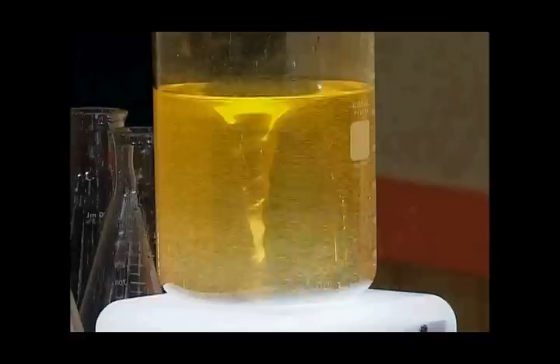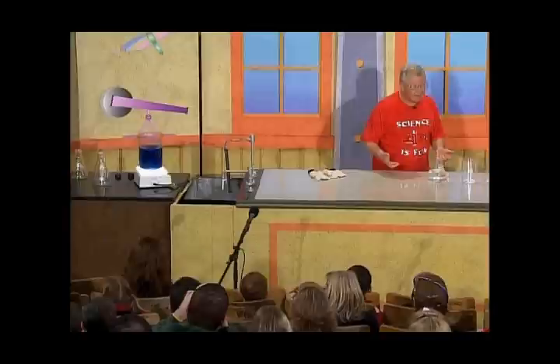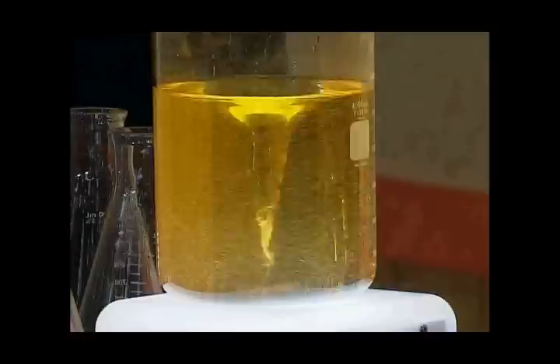I can't see anything happening. You're not paying attention to me anymore. I can't see anything happening. How come I can't see anything happening? I'm not looking. What's the big deal about looking? The last time I looked, the color of the liquid in the beaker was blue. Tell me when to look. Shall I look right now?